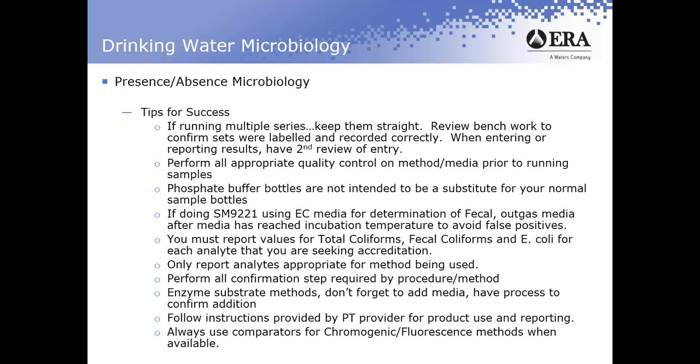Perform all confirmation steps required by a given procedure or method. You don't want to take the chance of getting any type of false positive results or false negatives. You want to perform any kind of confirmation steps that may be required. So do your normal procedure, whatever that happens to be.